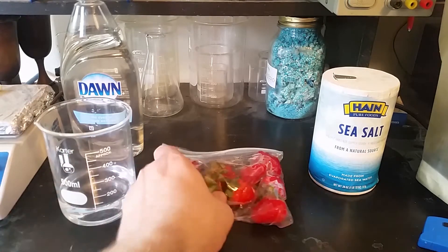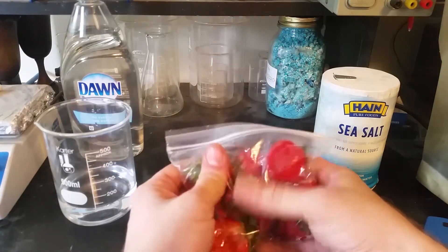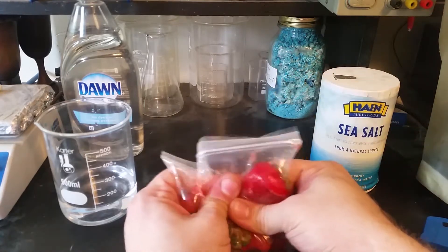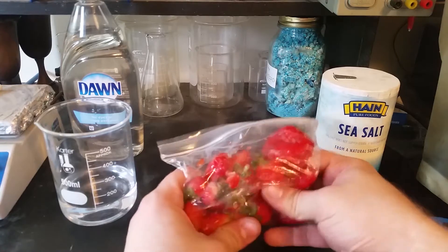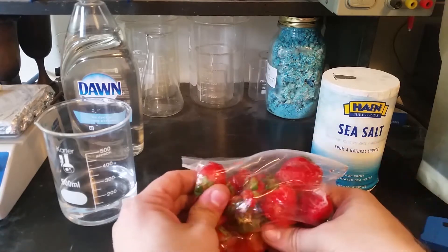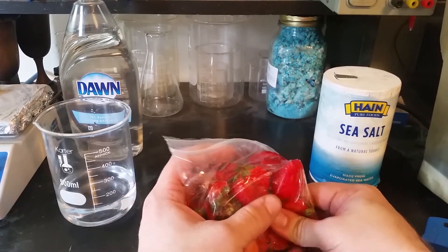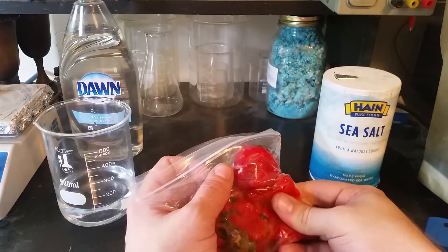So the first thing I need to go ahead and do is start breaking these strawberries up, start squishing them, damaging the cell walls essentially. And once I get these squished up, I will make up a solution of that water — that's about 15 to 20 ml of soap, and a tablespoon or so of salt.